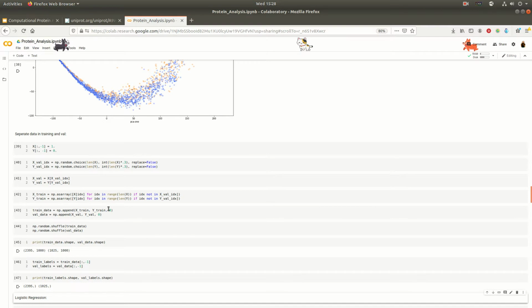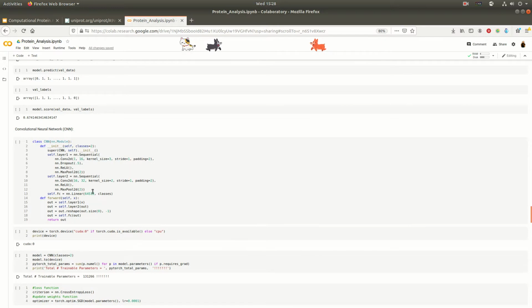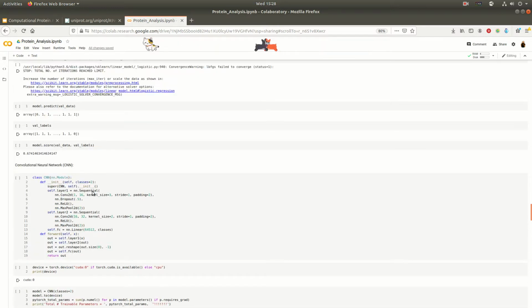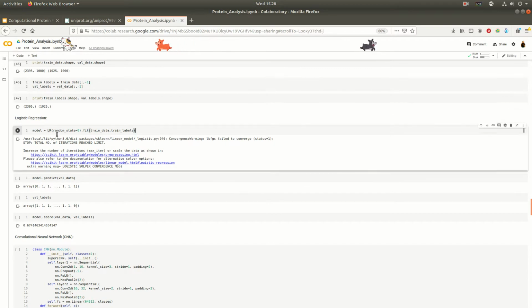Okay, now I'm going to show you how easy this is. You're probably like, oh man, how are we going to get through all this stuff? We're running out of time. Easy. I told you, the data is the hardest part. So you just say our model is going to be this logistic regression, LR, that we're using from scikit-learn. It's a library for Python. We're coding in Python.